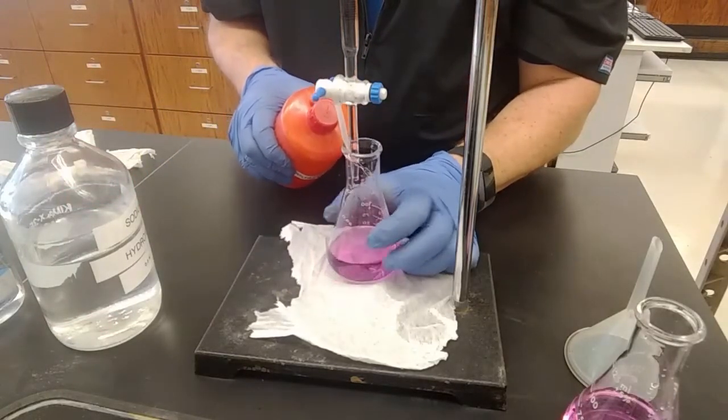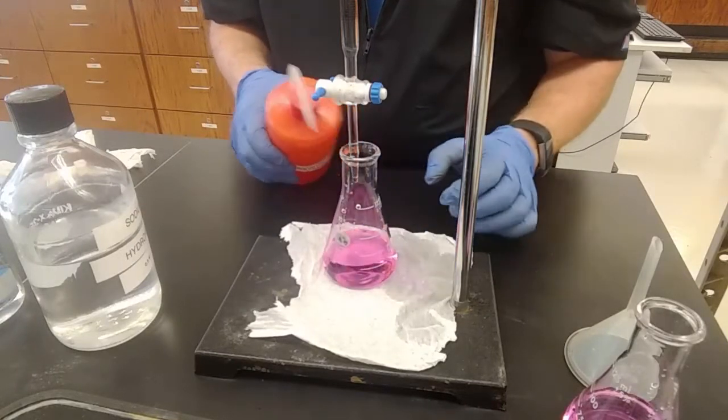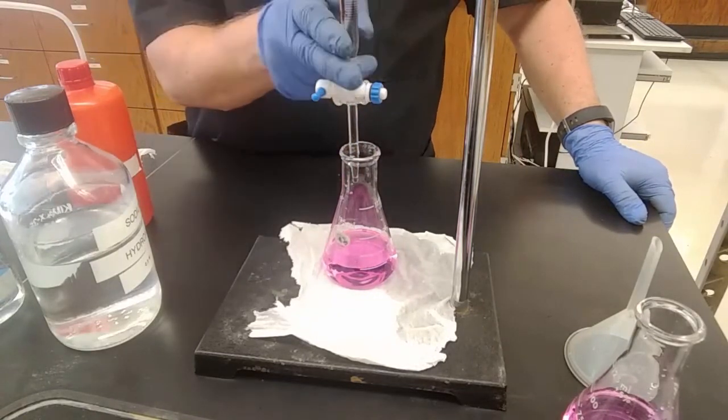Rinse down the tip just to be safe. Ooh, it turned a little bit darker. You know what? I may have gone one drop too far, which begs the question after step 10. What is the effect on my result if I add too much base?